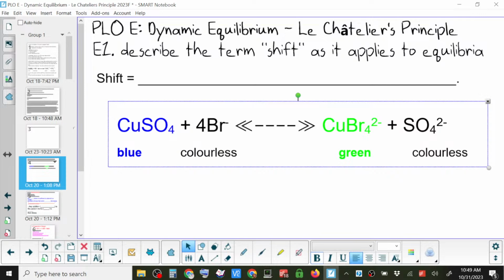So, this one was green, just like that one. I added more of the ammonium sulfate, so it went back to blue. Now, it's not the same as that blue, it's probably not as far, but it's pretty close. If I stir it, probably. I think there's a lot more powder in there that's not dissolving as well. Is it gonna become saturated? It's not dissolving. Yeah. Okay.